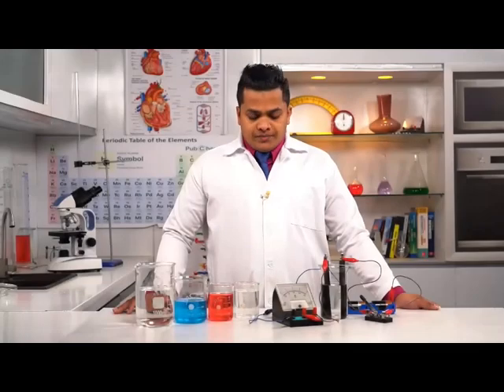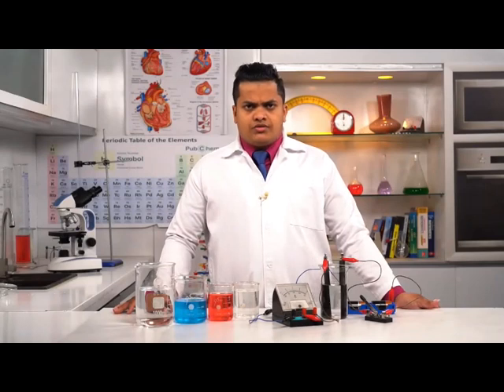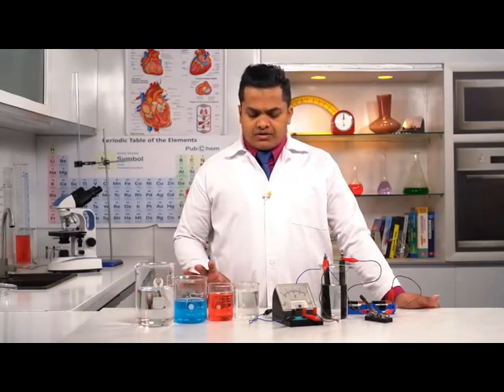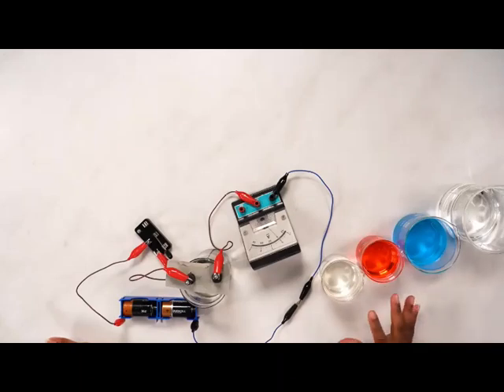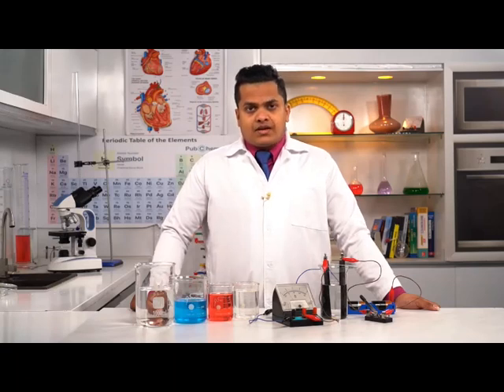So my dear children, now we are about to investigate several solutions. I have with me several solutions within this beaker. Within this investigation, we'll be observing what kind of solution can conduct electricity. What type of solution can conduct electricity.